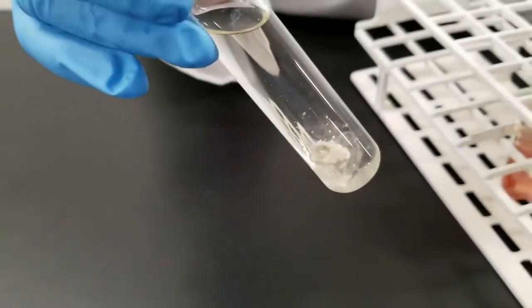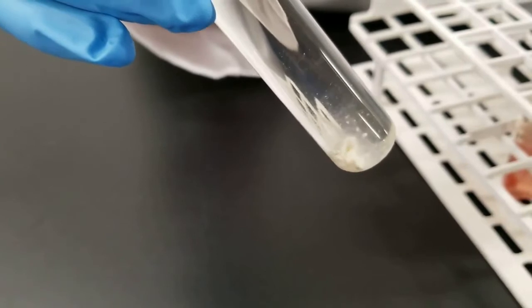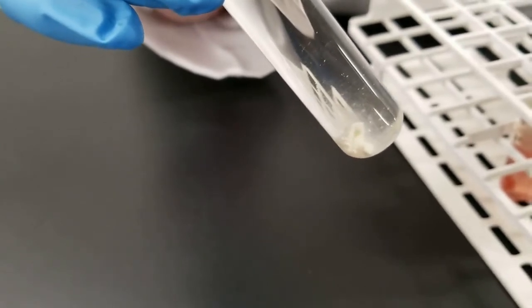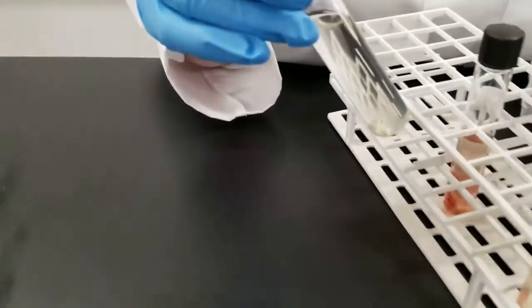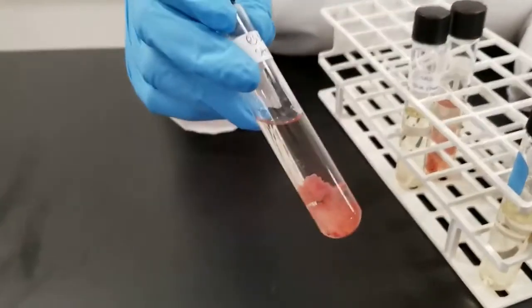And then we also had a blue cheese sample. Now, some fungi take longer than others to grow. Some of that is the chunks of the blue cheese, but you also have some fungi growing in there. Most of the liquid is clear. Once again, these were at 37, and then we had some that were at room temperature.